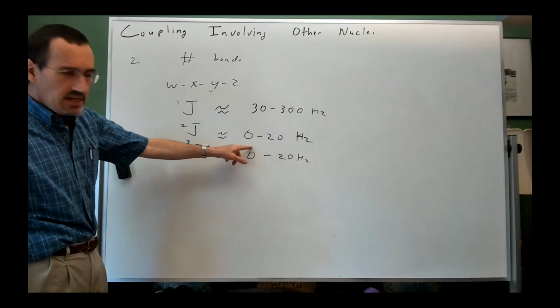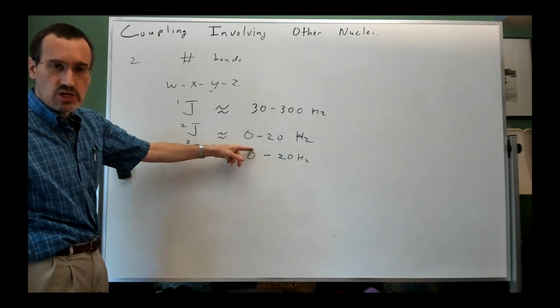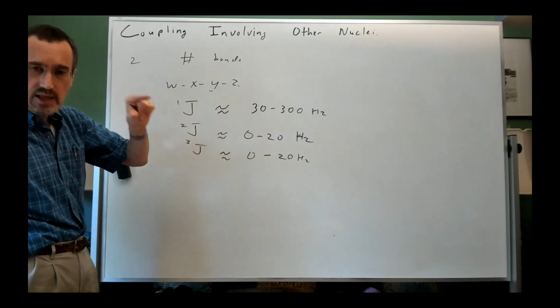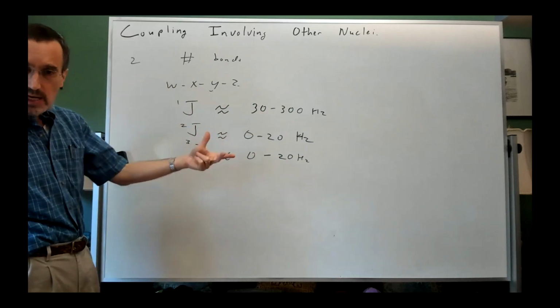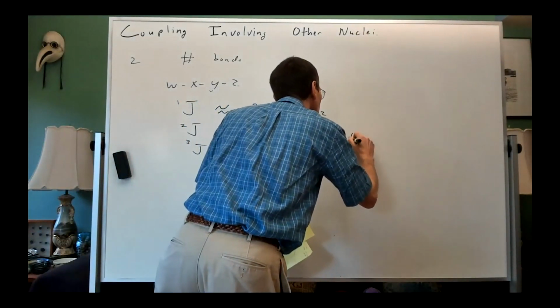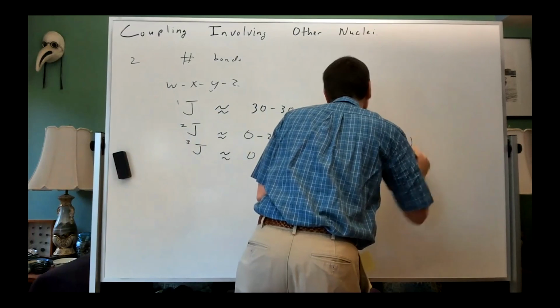The other thing that's interesting is that some of these are highly variable. We saw with the terminal alkene that J2 is very small. We've talked about dihedral angles close to 90 degrees, where J3 can be very small. So the other thing here, and it's not going to affect anything you do, is that often our J2 is negative.